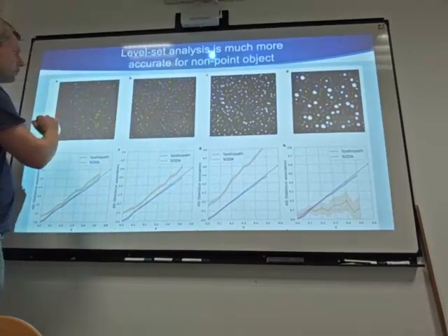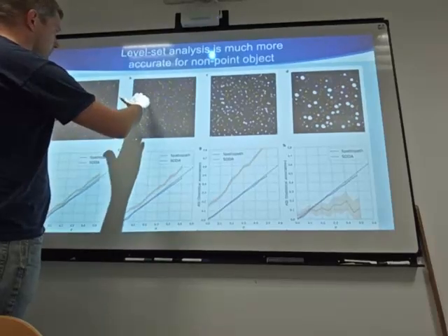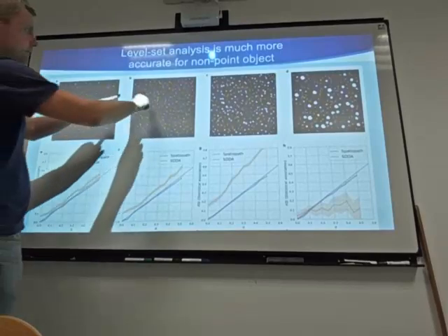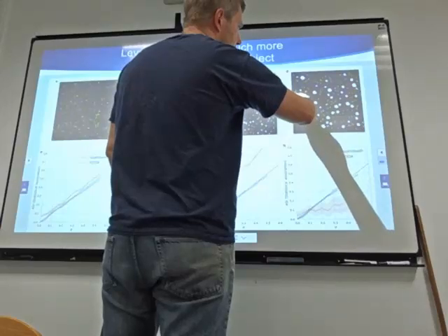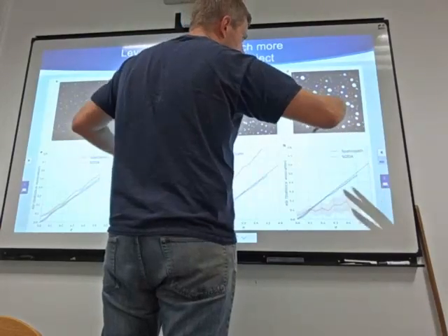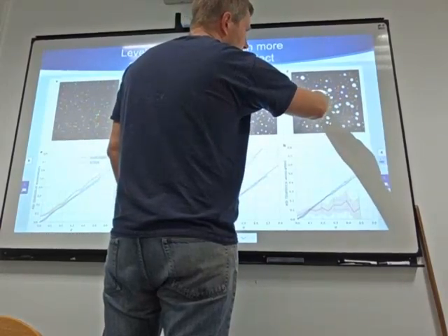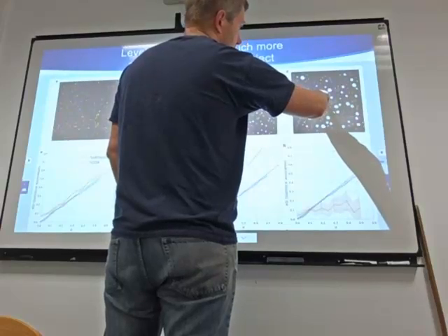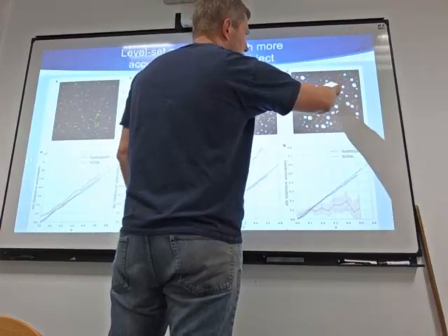And what we did was to grow the size of the red. So here, red are points. Here they are a little bit bigger, and much bigger. So here at the end, we are looking at these objects with some complex shape and big. And we are looking around with some level sets, and we look at the accumulation of, maybe, the green and not the blue.